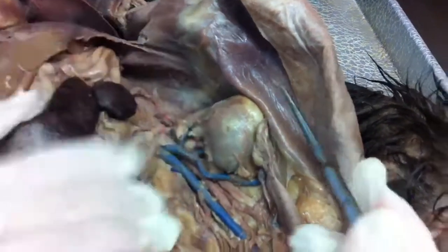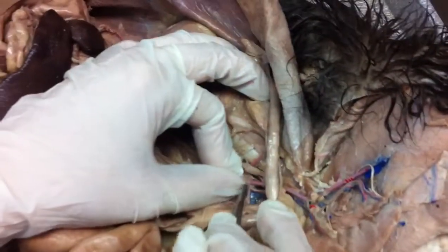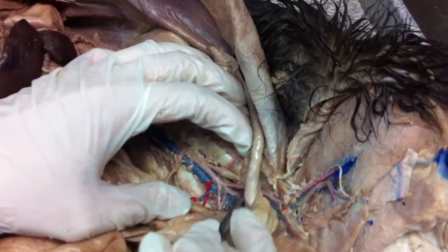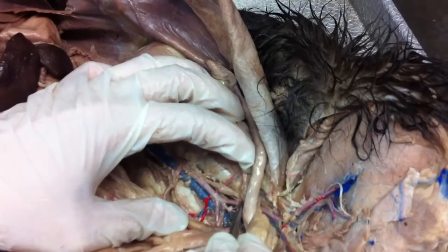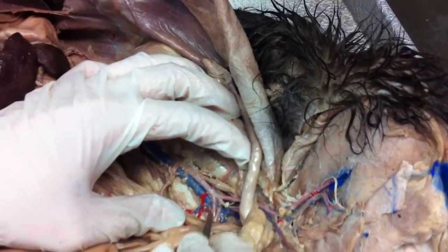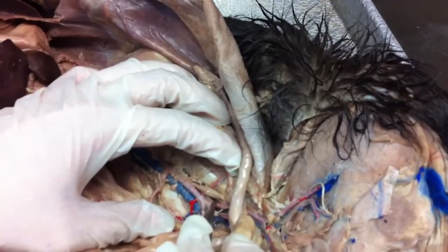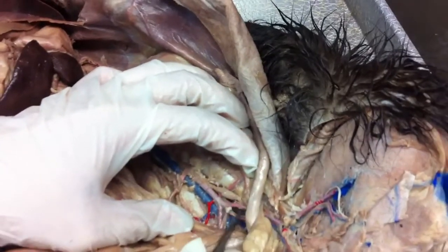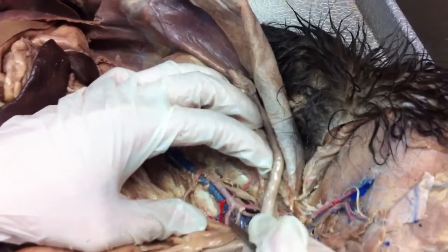Okay. So now we get down to the bottom, and it's actually much easier to see this as compared to the iliacs of the veins. Okay. Let me clean it up even more if I can. So we have these right here, and these are the left external iliac artery and the right external iliac artery. So think of this as like a little bird's foot with like several toes. Okay. The toes to the outside would be like his pinky toe and his big toe, right? Be left external iliac artery and right external iliac artery.